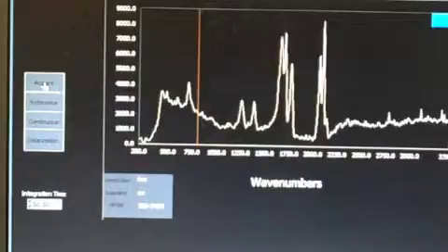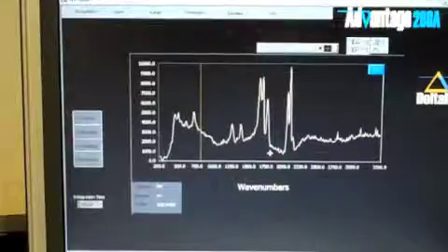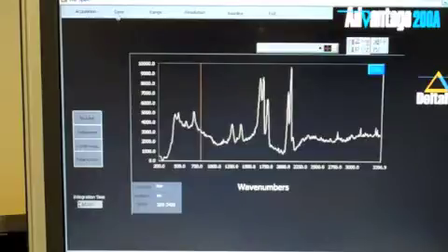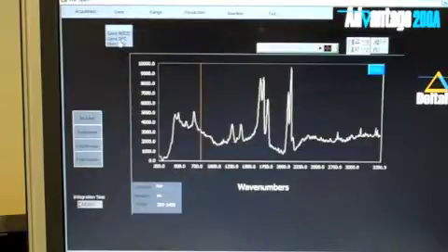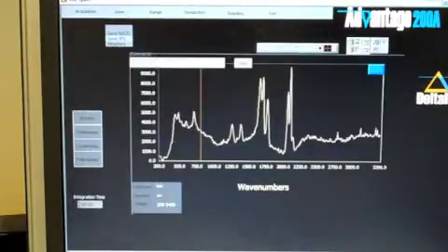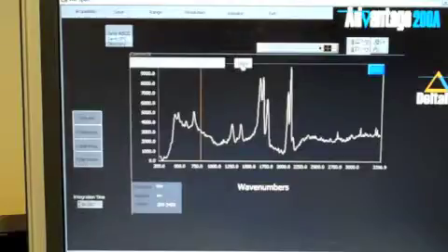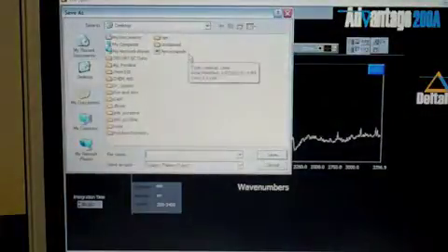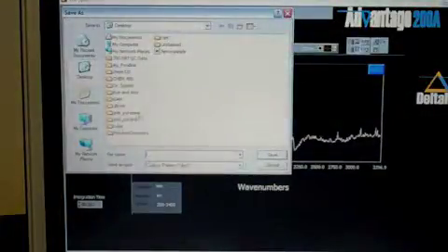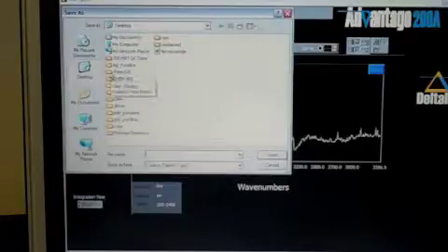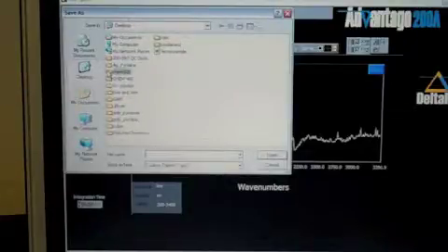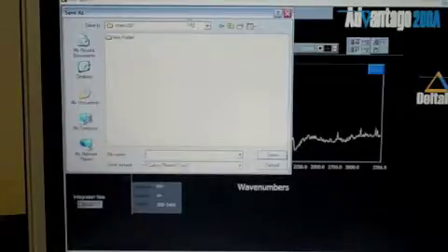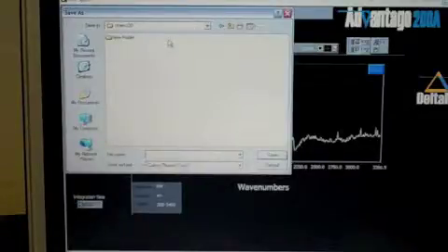When you have a spectrum you wish to keep, click the word save along the top of the screen. If you want to work up the data with Igor Pro, choose the ASCII 2 format. Otherwise, choose the SPC file format. Then click the save button on the spectrum. This action should open the directory for your files. Open the folder for your class or your research group and type the file name in the appropriate box at the bottom and click save.